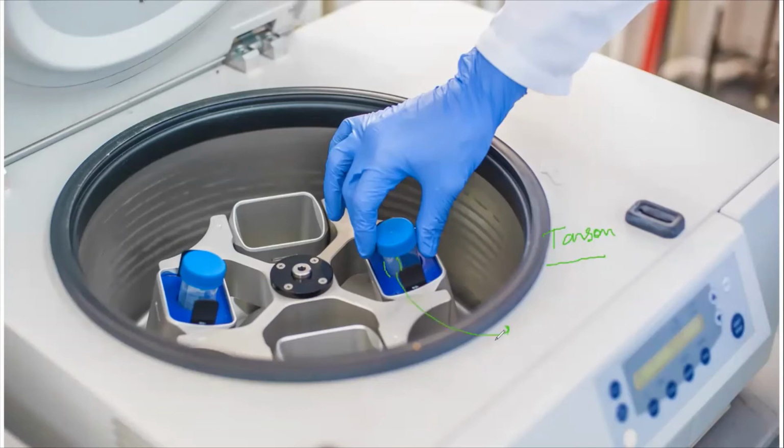Can you see? This is meant for labeling, so that you label what you have added into this, and one you keep for balance. So in the case of a centrifuge, you need to have a balance. If it is not properly balanced, the machine is not going to start. It will not start rotating. So this is how you keep it, okay, your machine looks like this.